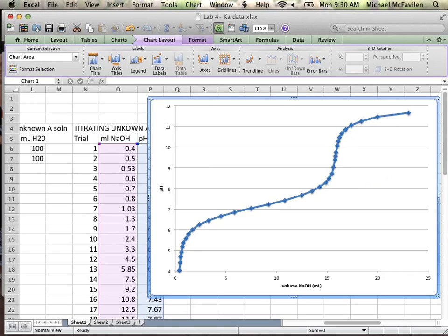You see data points pretty much all the way running smoothly up, which smoothly turns into a curve, and then smoothly turns into a curve the other direction. So it should be nice and smooth all the way through it. If you get jumps or breaks in it, that's not ideal, but that's what happens. Okay? It just comes down to how careful and slow you were through this.